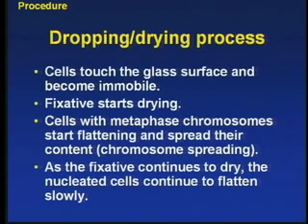You may still have a lot of cells in other stages of the cell cycle, so they're not going to give their chromosomes to you. But their nuclear material is also going to be flattened out, so if you look at the slide, you'll see a lot of black circles around. Those are cells which are not in metaphase, but that's the nature of the cell growth condition.